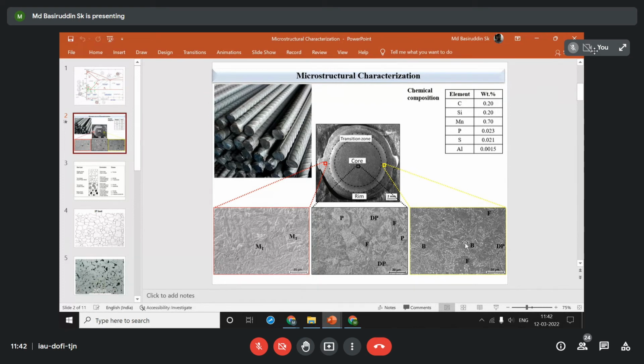If you have a microstructure that is fully homogeneous, that is a mixed microstructure, you may find that the sample's macro hardness is the same everywhere. But if your sample microstructure is different at different positions, then following macro indentations, you will find that at the surface the hardness is high, at the interior the hardness is relatively low, and at the intermediate stages the hardness is intermediate. That is because the center is composed of the soft phase as well as a little bit harder phases, so the combination gives the minimum overall hardness value at the center.